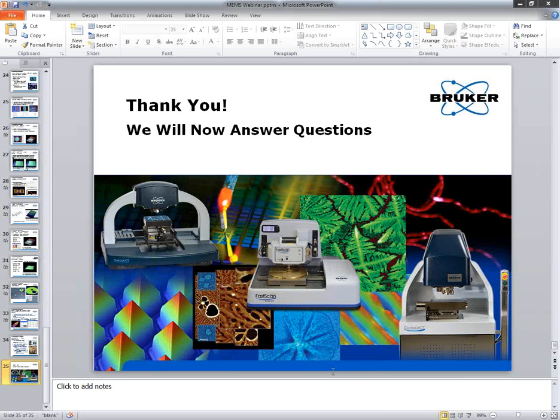Another person asks, how do we handle the light level? Because it seems like you need a lot of light if you're strobing, and that's true. We use extremely high brightness LEDs and a fairly optimized design in our MEMS metrology system so that we can get maximum light onto the sample. There have been situations where we've been challenged with light, but for most applications, it's not been an issue.